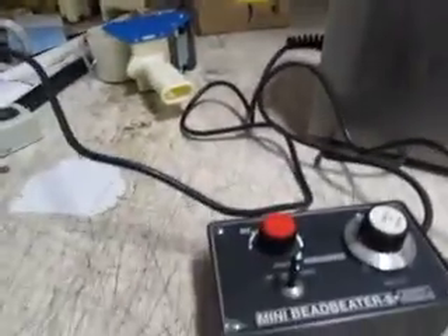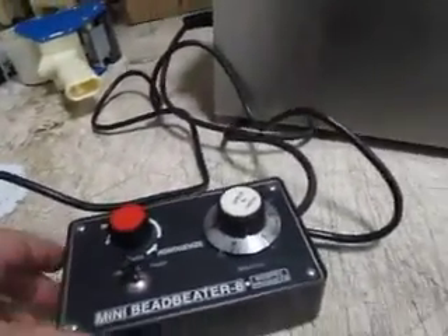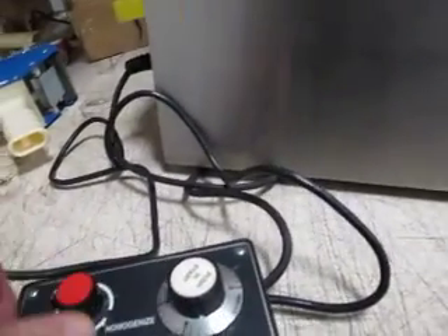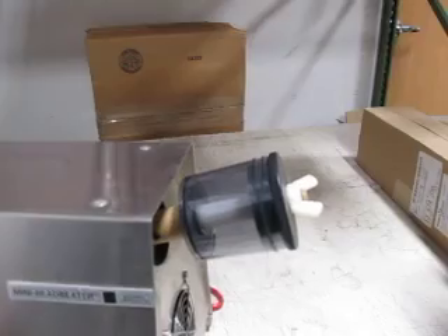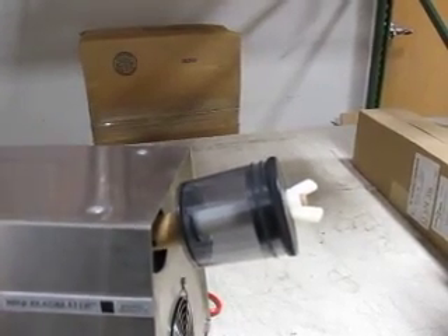It is fully functional. I'll turn it on — you can hear it at idle. And then you can see this is a real gradual control, but you can control the speed.